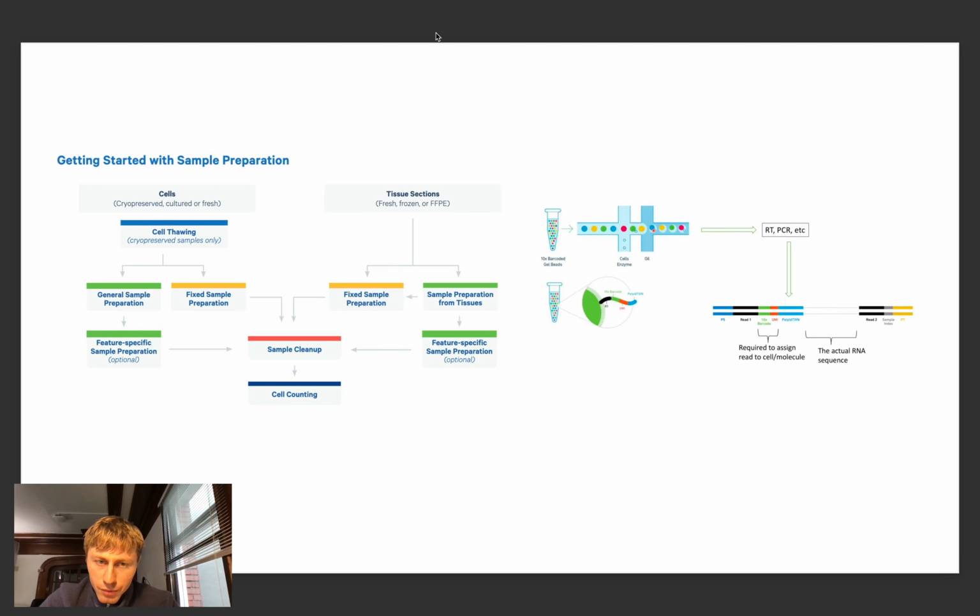Of course you have all of the microscopy, and then if you go to single cell RNA sequencing, and you have a tissue, you need to prepare it. There's no general way of breaking down tissue and getting a single cell suspension, and this is what 10x also writes.